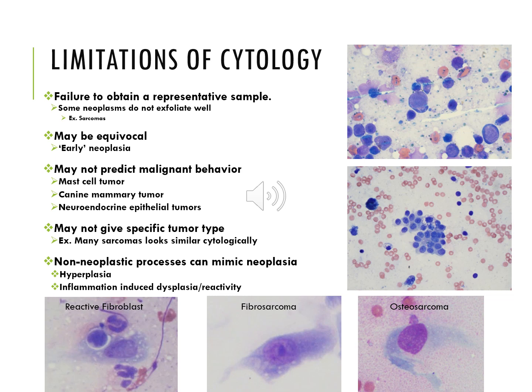And then as we started to look around more, we found large numbers of fungal agents that were present. So it's just important to keep in mind that inflammatory processes and infectious agents can cause these dysplastic changes as well, which can mimic neoplastic changes.